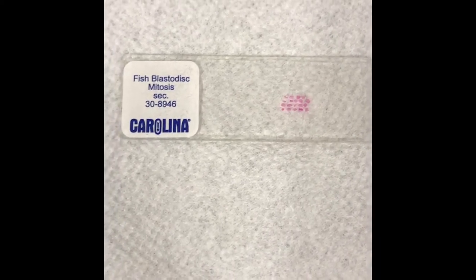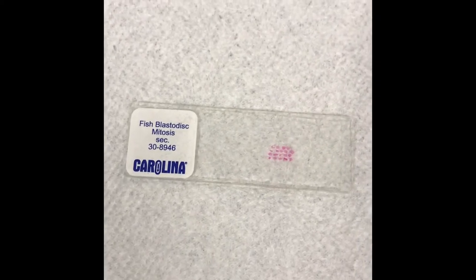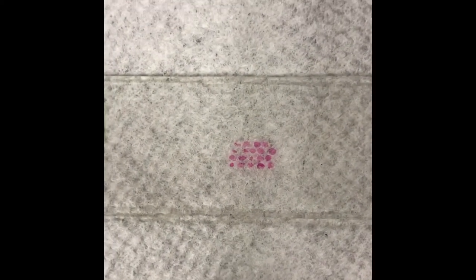The slide that we're going to be using is fish blastodisc. It's fish blastula. These are egg cells that are dividing very rapidly through the cell cycle. And you can see all the little dots. Each one of those dots is a different blastula or hollow ball of cells. So that should give us a lot of cells to look at.